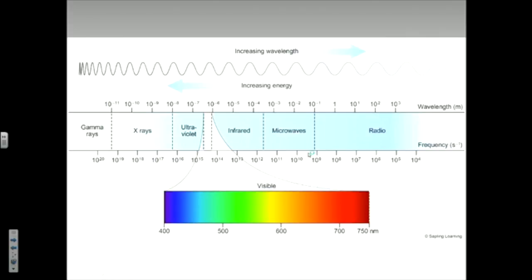And there's not time, it's not important, but suffice it to say, electromagnetic radiation is a form of energy that's found as waves. Depending on the distance between the peaks of those waves, what we know as the wavelength, that affects the energy of the particular radiation. So the shorter the wavelength, the higher energy the radiation will be. Longer wavelength is lower energy. Longer wavelengths on the order of meters are your radio waves, slightly shorter is microwaves.